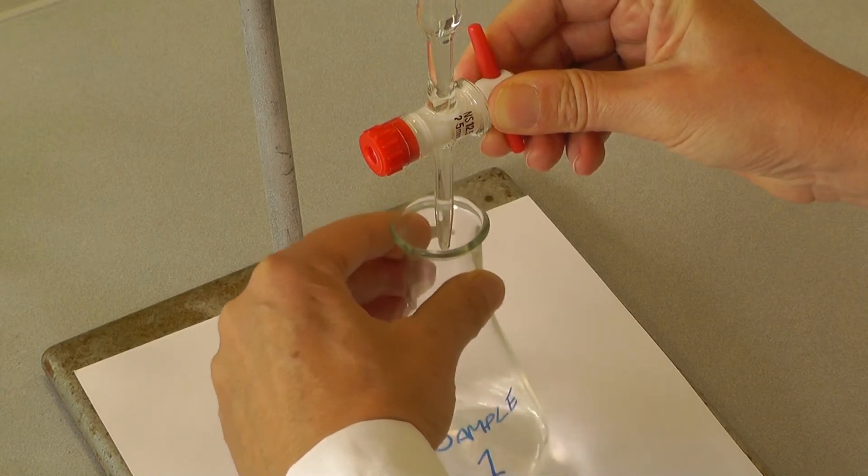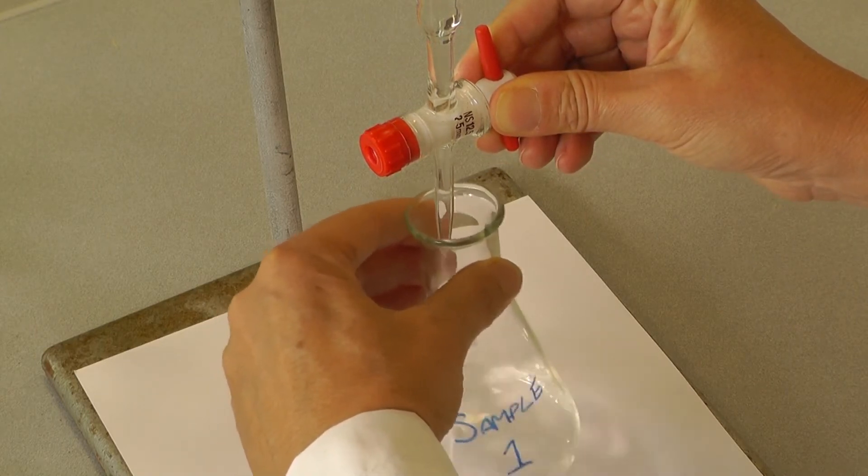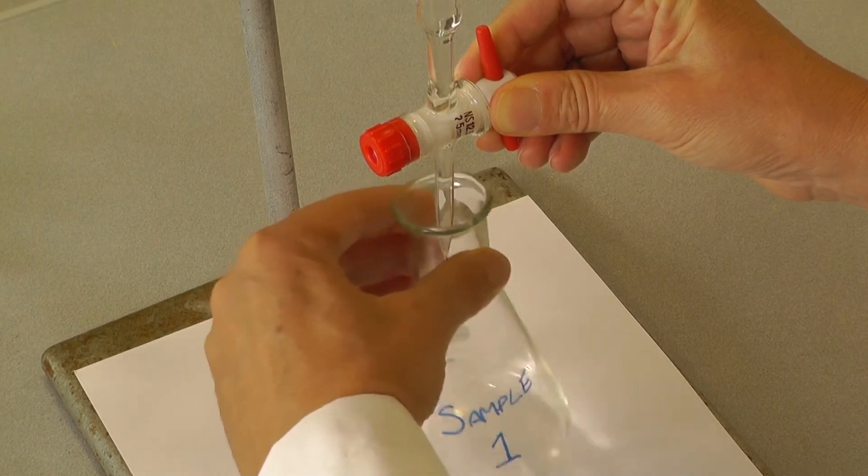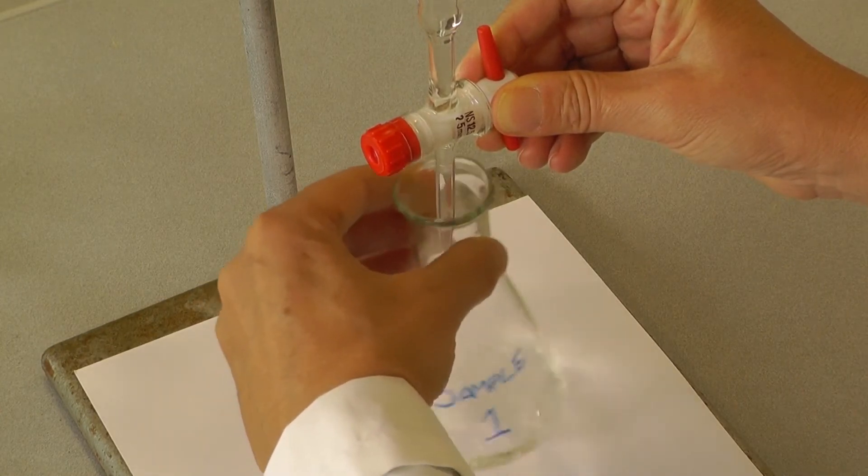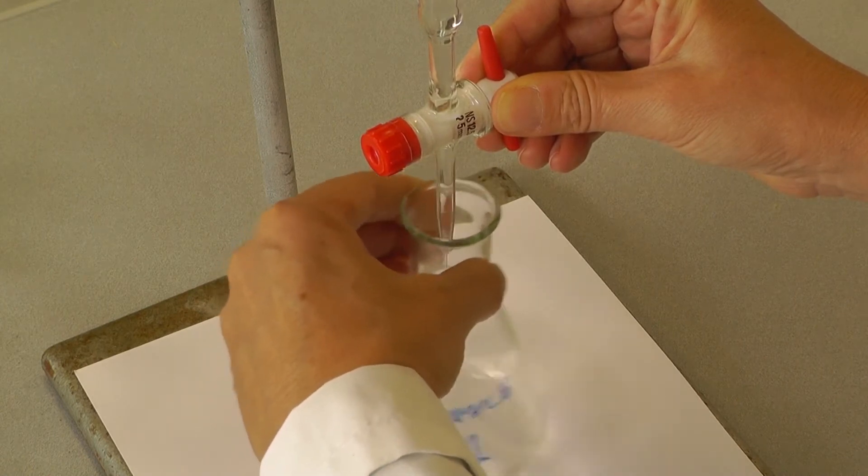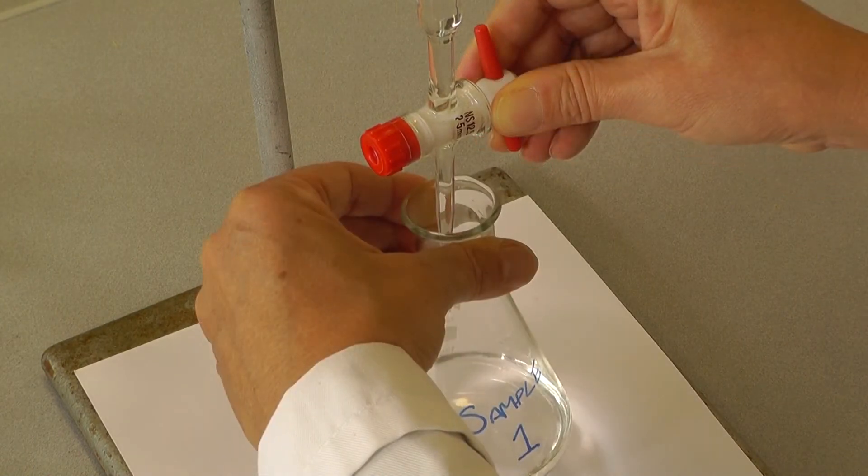Keeping one hand on the flask and one hand on the burette, open the tap as you swirl the flask. Initially, the solution can be added quickly, but you must keep swirling and pay close attention to the reaction mixture in the flask.